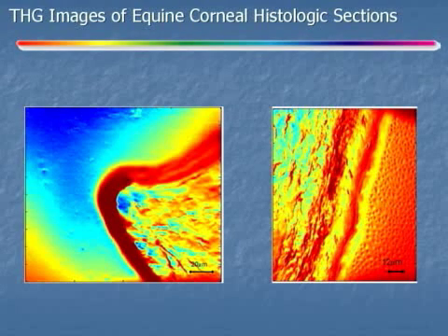You can see a couple of features. I'm an engineer, I'm not a biologist, so I don't know the anatomy. I forget what this is called, but this is a kind of protein membrane. Probably someone here knows what this is. You see this protein membrane on the back end of the cornea. There's collagen in between. On the right, you see essentially the front surface of the cornea of the eye. These are just a couple of examples.